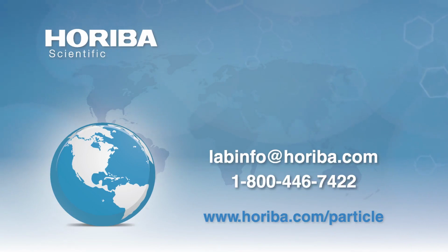A very last question is pretty practical. And just a side note, people are measuring the COVID-19 coronavirus, since it has a zeta potential of minus 30 millivolts, and they use that to trap the virus in the nanopores for detection. So I thought that was kind of interesting.